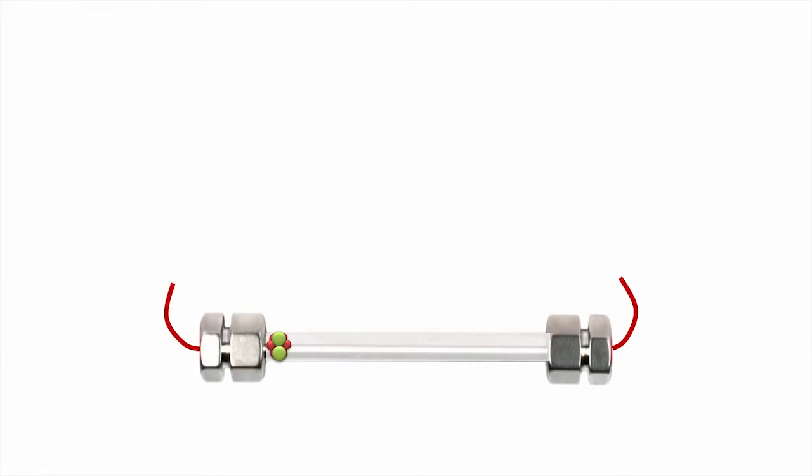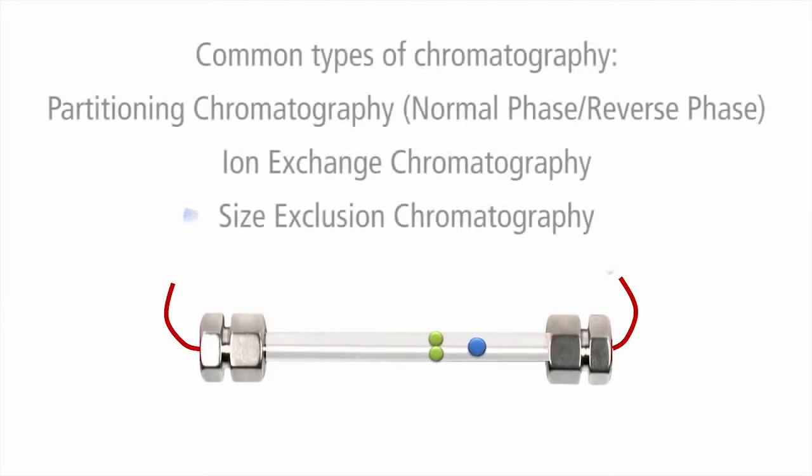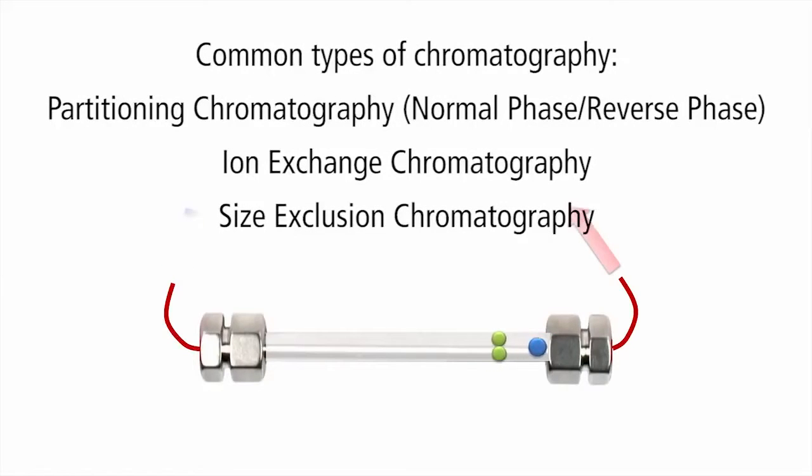Once a sample is injected into the LC, it is forced by a liquid at high pressure through a column that is packed with the stationary phase. Molecules either associate to the stationary phase or are carried in the mobile phase depending on their characteristics. The most common example is reverse phase LC that separates the sample components over time based on their hydrophobicity. From there, the sample travels to the ion source of the mass spec.